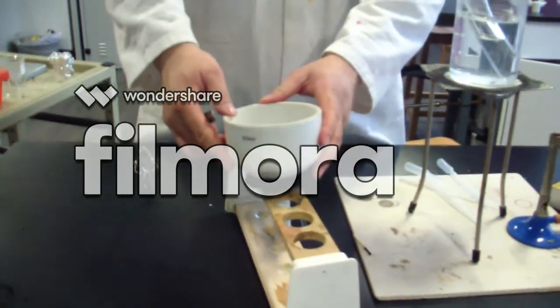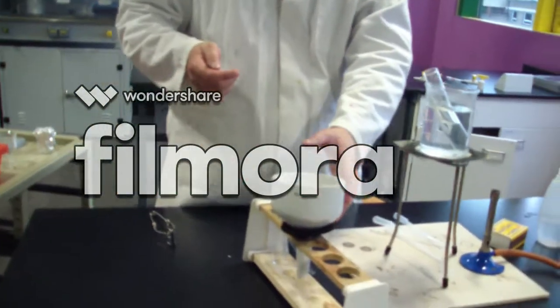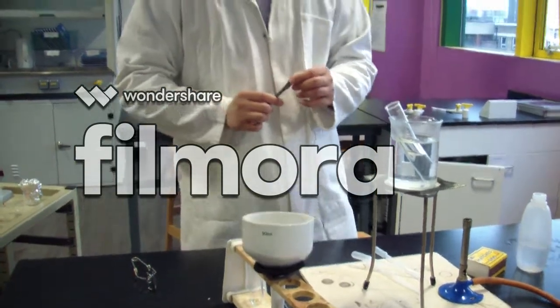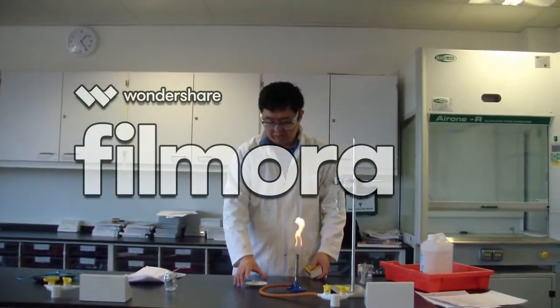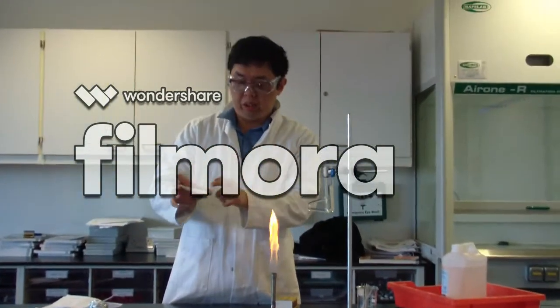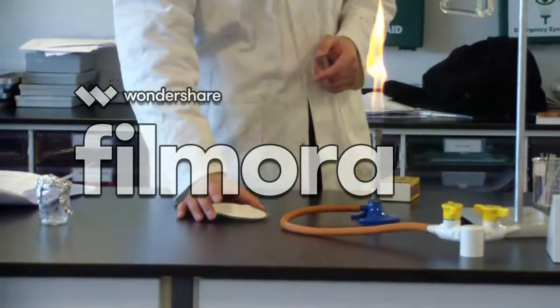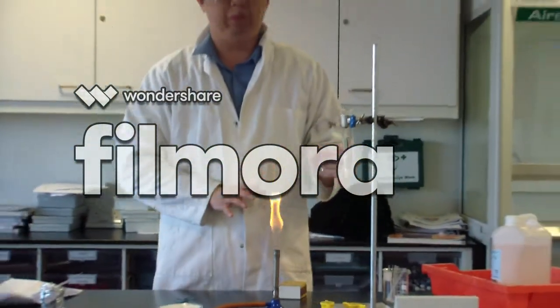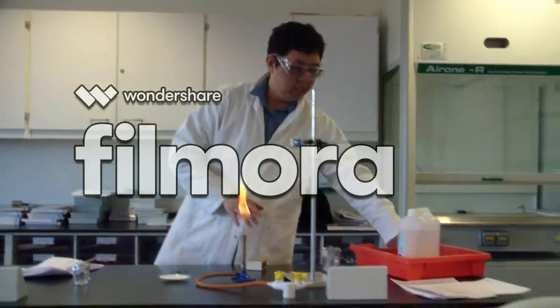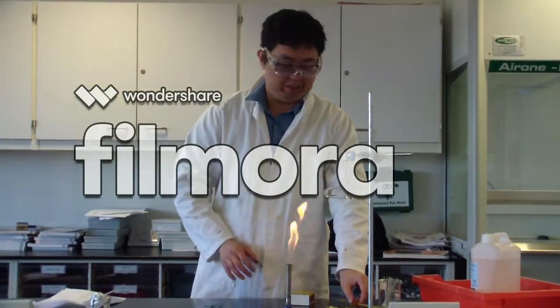Once that has dried, we can start doing the melting point in order to determine whether it's pure benzoic acid. And that would be the second part of part 2. Okay, so now the benzoic acid is nice and dry, and you can see the tiny needles of benzoic acid. Now we are going to set up the melting point apparatus. We have the Thiele tube, a mercury thermometer, and a Bunsen burner.